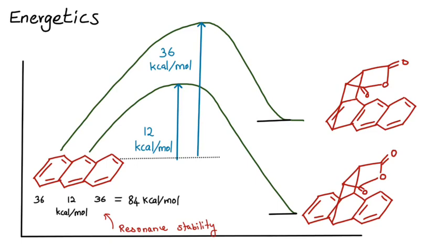Now, in the lab, we're going to use an apparatus like this, a round bottom flask, and take your anthracene. The book says add 0.22 millimole of anthracene, which is roughly equal to 0.039 grams of anthracene.